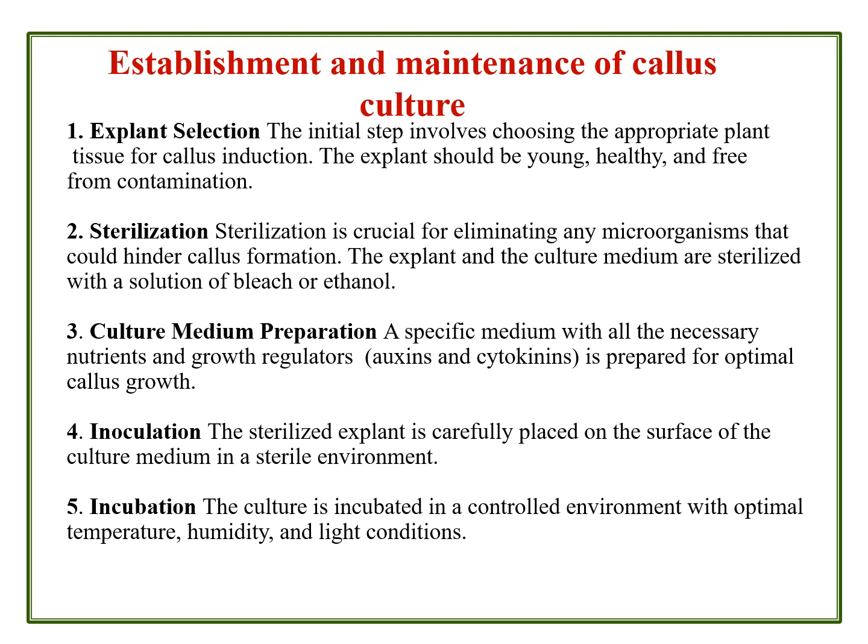Then, establishment and maintenance of callus culture. So there are some factors that influence the establishment and maintenance of the callus culture. The first one is explant selection. The initial step involves choosing an appropriate plant tissue for callus induction.